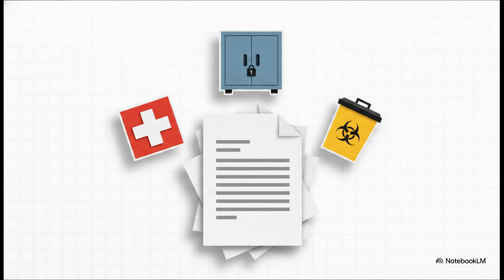Imagine a spill happens right in the middle of a bustling lab session, or maybe a student accidentally gets something on their skin. You definitely don't have time to flip through 16 pages of dense text. Where do you look? Boom, Section 4, First Aid. You go directly there. What about when you're receiving a big order of supplies over the summer and need to know exactly where to put a brand new substance? That's Section 7, Storage. And when the lab is totally wrapped up and you've got waste on your hands, you flip to Section 13, Disposal.